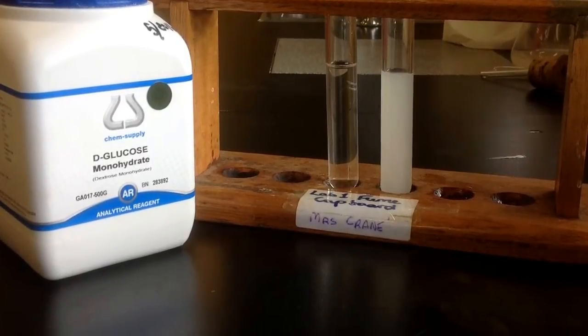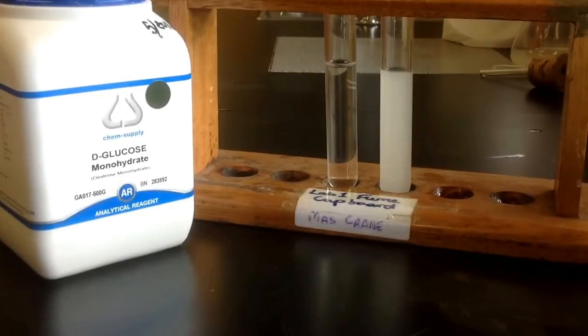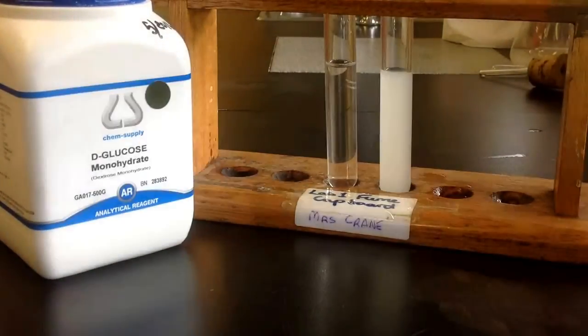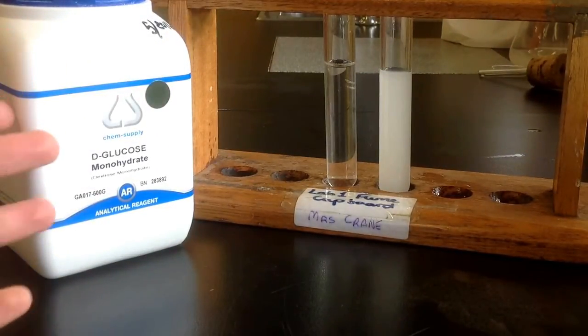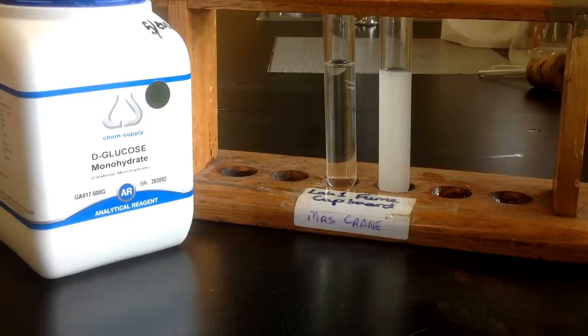Okay, so I thought I might do this practical again. This is the test for reducing sugars, which glucose is one. You can see glucose here. This is the powder I used, and that's what I used to do the fermentation.